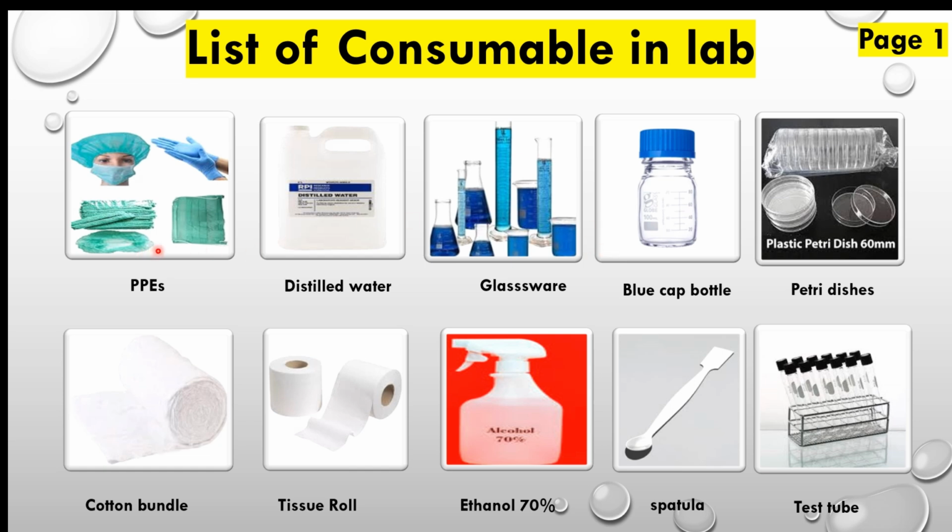First one is the PPEs. PPE is personal protective equipment. This is the most important need for any laboratory, in which we need gloves, face masks, head covers, and shoe covers, just like all these things for the person.